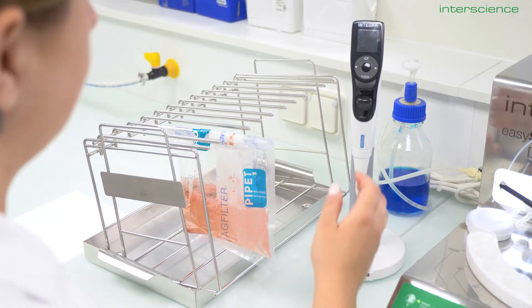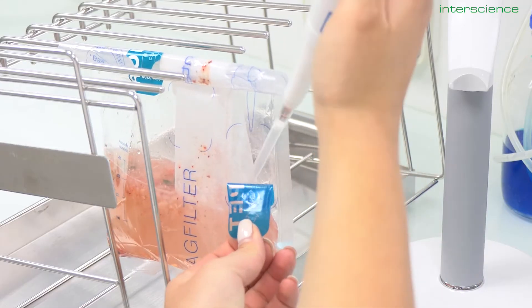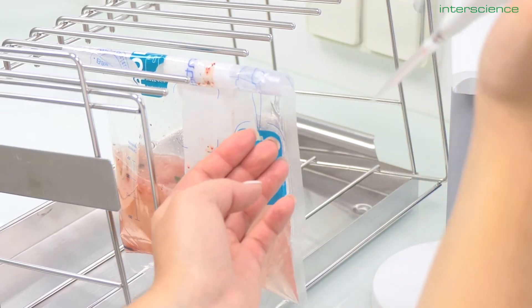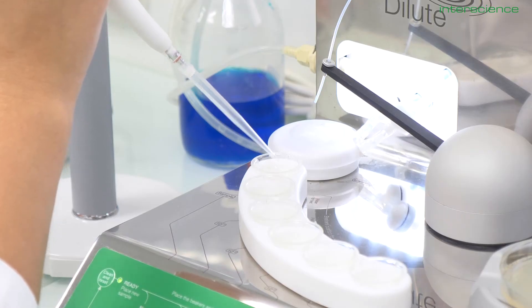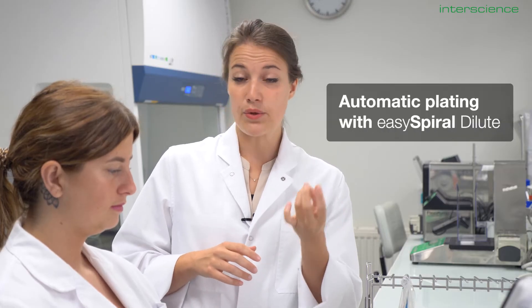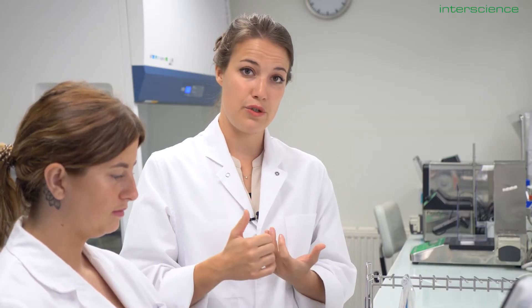After having weighed and diluted our sample and poured it out on plates, it is now time to plate our sample on a petri dish. Thanks to the filter integrated into the bag, Manon can pipette a particle-free filtrate that will allow for fewer false positives on the plate and a more accurate enumeration. Today Manon wants to plate either the 10 to the minus 3 or the 10 to the minus 4 dilution. To have a countable range, she would usually plate at least those two plates, if not 3 or 4.